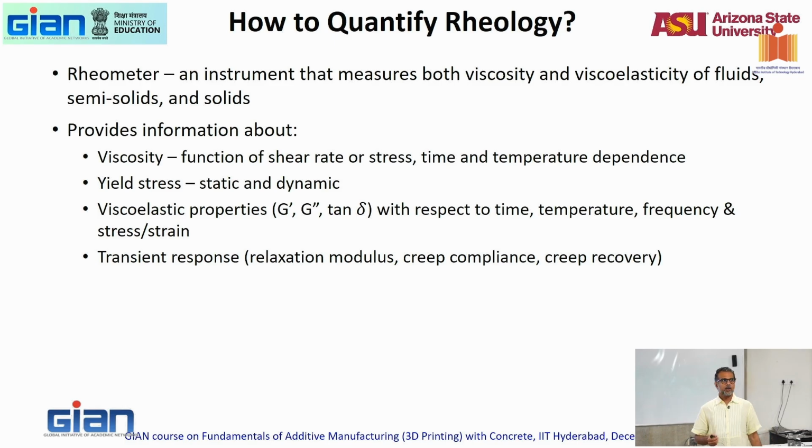Okay, how to quantify rheology? We use what's called a rheometer, which you will see in the lab in the evening session. An instrument that measures both the viscosity and the viscoelasticity of fluids, semi-solids, and solids. You get information about viscosity as a function of shear rate or stress. You can get the time and temperature dependence. Again, viscosity is time dependent, viscosity is temperature dependent too. What happens if I increase the temperature? Will the viscosity go up or come down? Viscosity comes down if you increase the temperature, right? So temperature dependence is there.